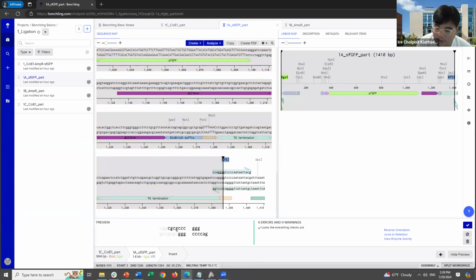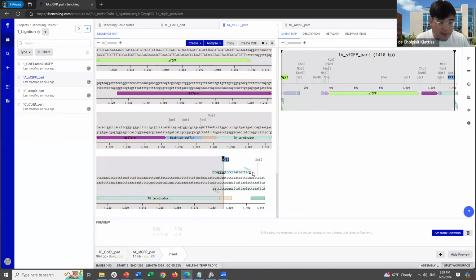And it actually showed you that the SGS1 part right here, from this piece and this piece, actually meshed together. So it means that this is compatible. And if you do it by hand, you have to ensure that your copy paste is matching properly. But by using this wizard that they provided, you can actually match them accordingly by letting the computer help you validate this process as well.